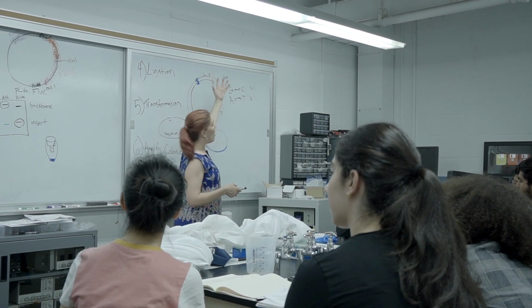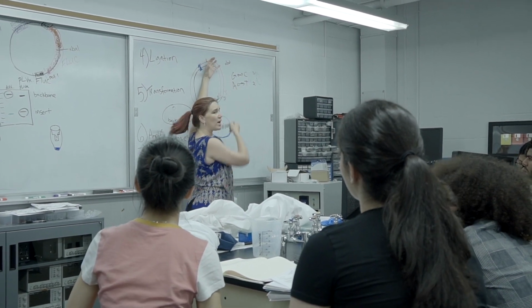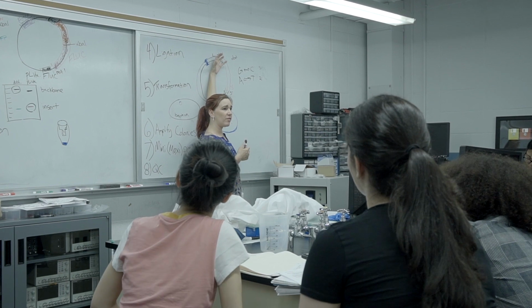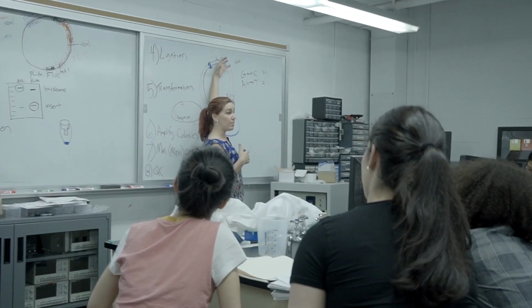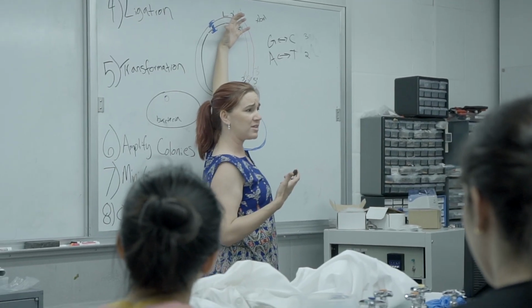And then once that polymerase, that big enzyme, attaches, what's going to happen? What was another thing we had in our PCR reaction? The deoxy nucleotide mix. Does anyone know what that is exactly? What a deoxy nucleotide is?